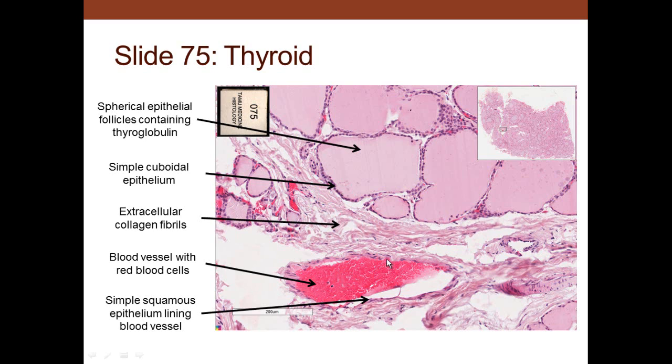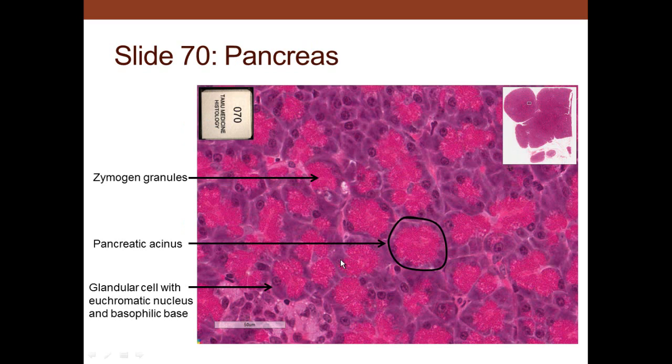The blood vessels, this is probably a vein with a big lumen. There's some white blood cells and red blood cells in through there. This is maybe a venule. And sometimes we can see little capillaries in through here and here. A little artery right there. It's kind of wrapped apart, but that's a little artery there. And you have simple squamous, one layer of cells lining blood vessels, known as endothelium.